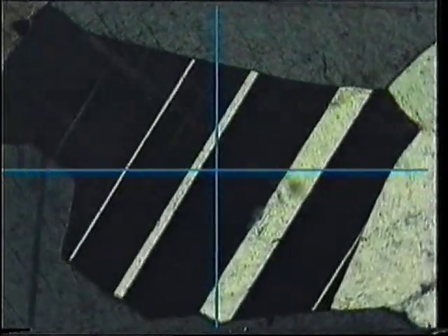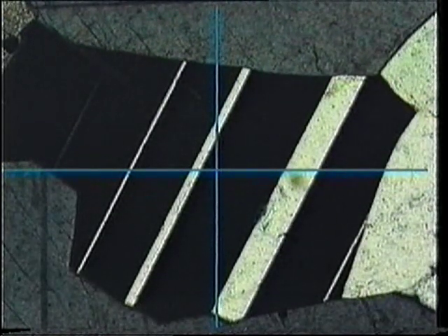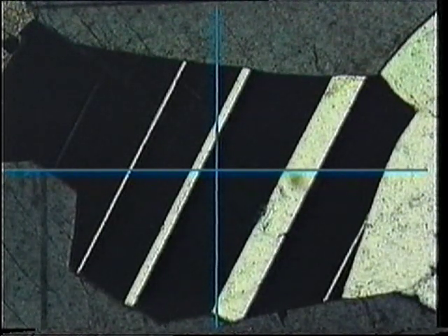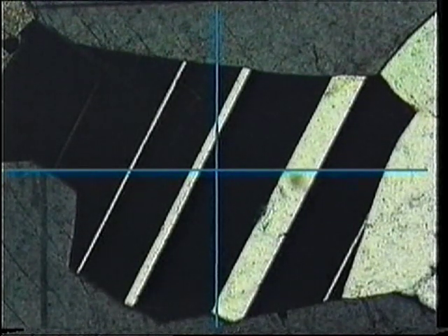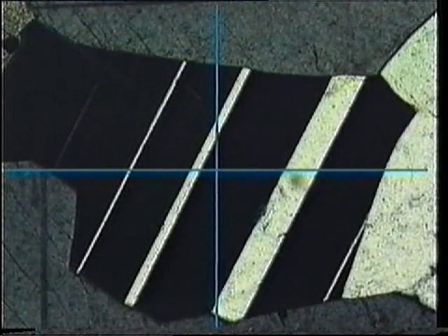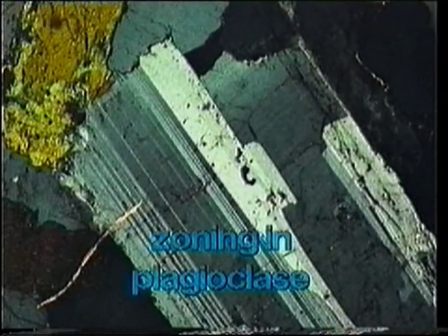Similarly, get the extinction angle for the other set of twins. Average the two extinction angles, provided they differ by less than about 4 degrees. Repeat this for about 10 grains and use the highest angle to read the composition off the appropriate graph. Two possible compositions result for angles less than about 20 degrees. See your lab manual for further information.